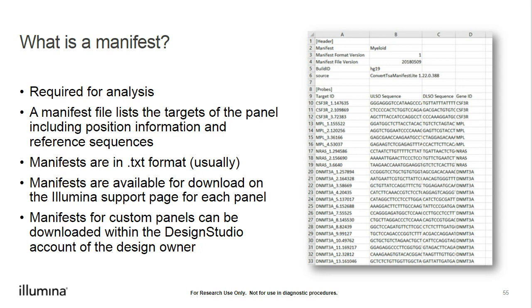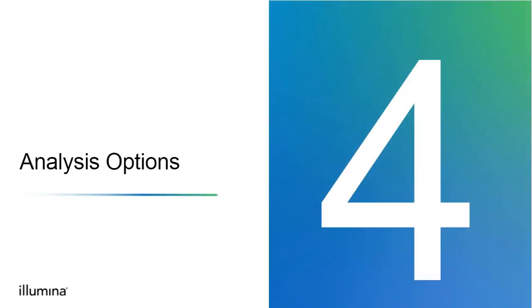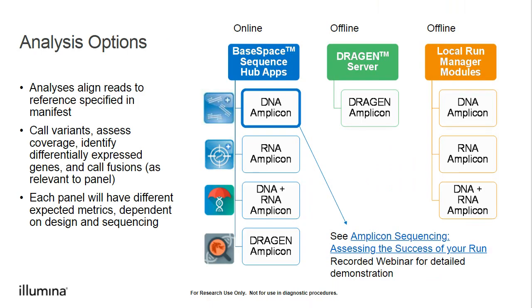So let's discuss now how the manifest is used during analysis. Since this is an introductory webinar, we will be doing a high-level overview of the available analysis options. There are both online and offline analysis options available. Amplicon analysis tools work by aligning the reads from the sequencer to a reference that is specified in the manifest. Analysis outputs vary depending on the type of panel, but generally they can call variants, assess coverage, identify differentially expressed genes, and call fusions.